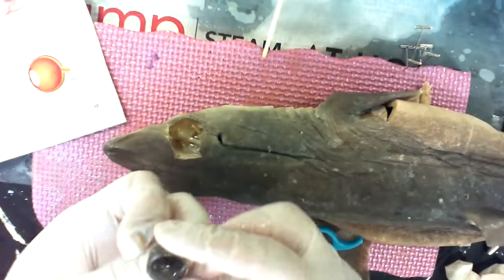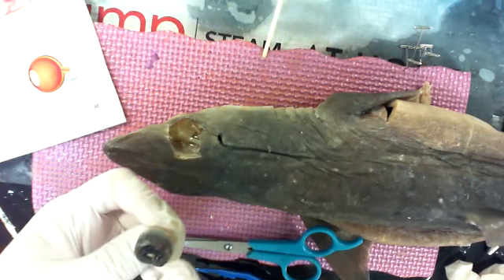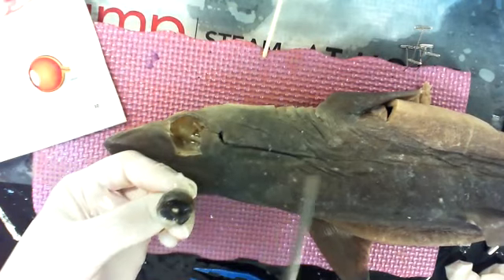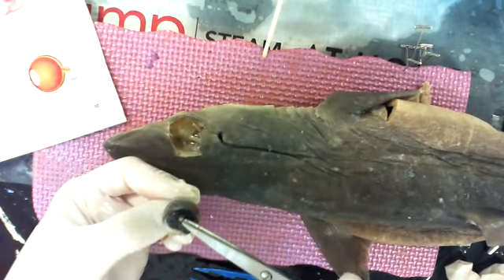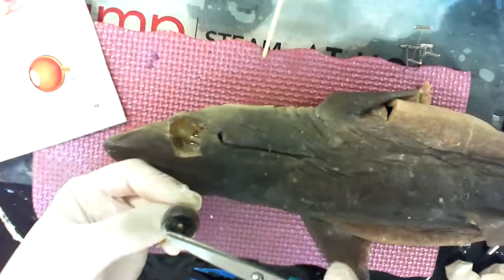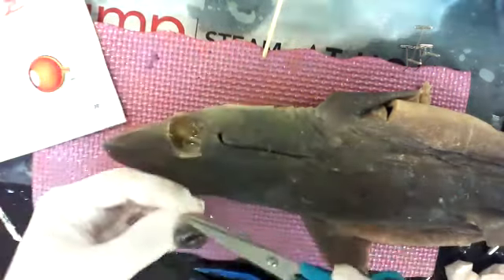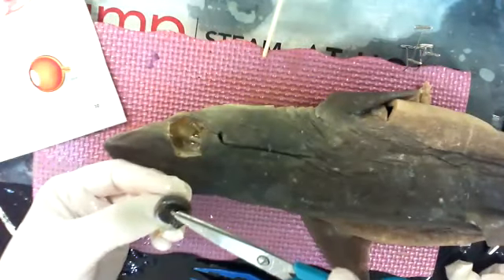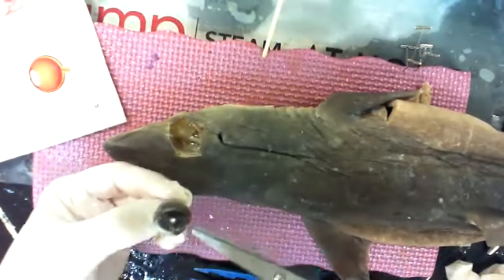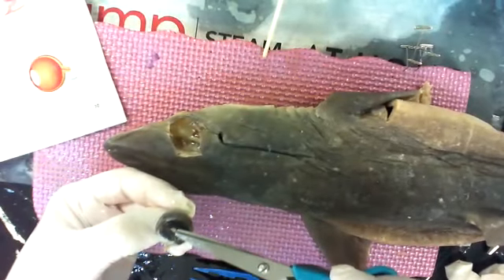So the eye is a little bit dehydrated. I'm squeezing it a little bit. When we cut into the eye, you don't want to squeeze because if you squeeze, it could pop and it will squirt. So right here, the center, the dark spot, well, I can see it's white now, but that's the pupil. All this coloring around here is the iris. The whitish part is called the sclera. The sclera blocks light from coming in anywhere except the pupil. The iris adjusts its shape to open up the pupil. So if you have blue eyes, it's the iris that gives you the blue. When you're in a bright room, you see a lot more of the blue because the iris shrinks down to give you a small pupil.